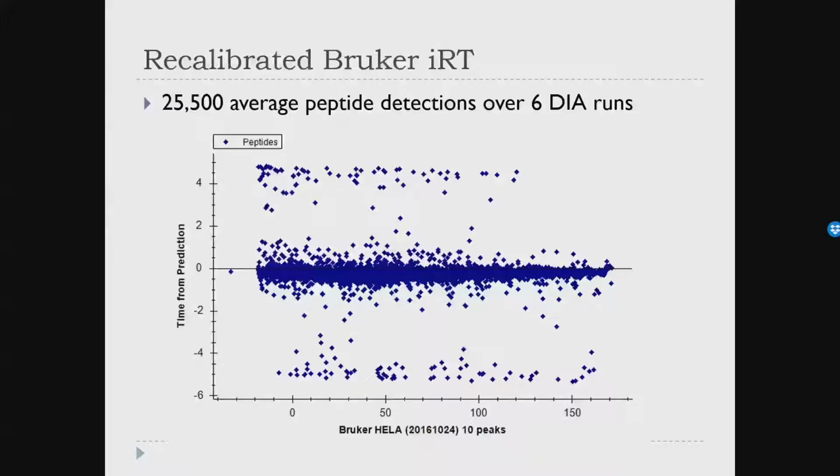Your libraries are not looking at the MS1 at all. And then I got this. And so this is a lot closer to the ideal. Most stuff is lining up within a half a minute. There's one other weird effect here. Can anybody identify what it is?